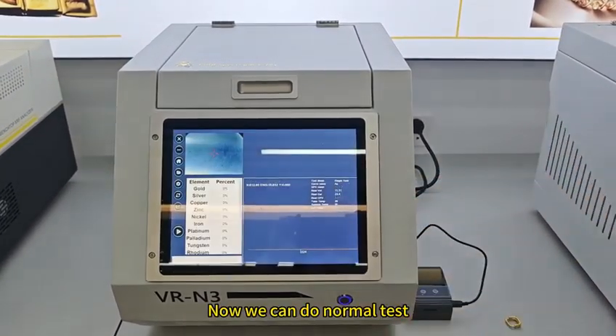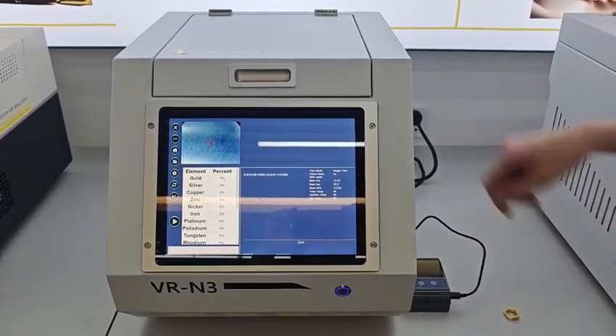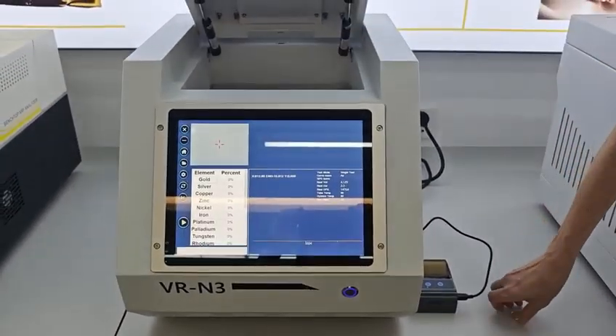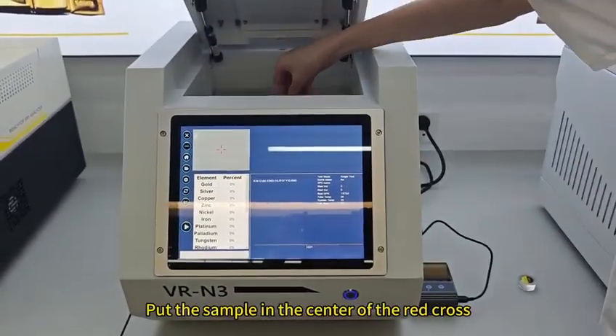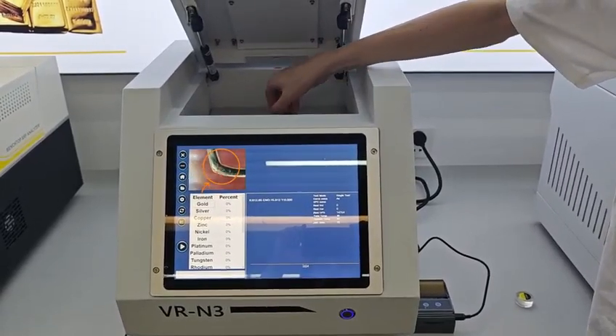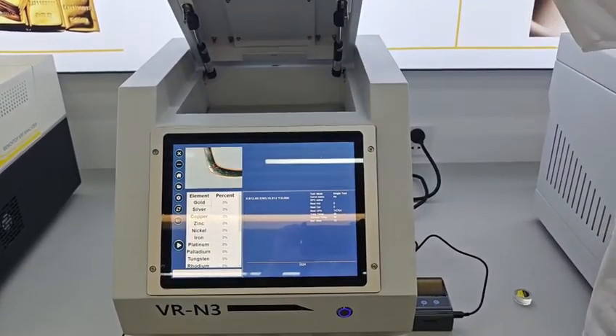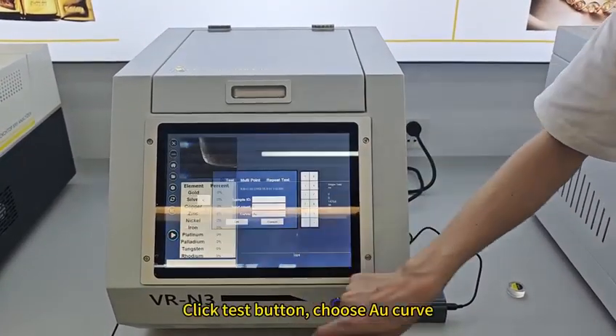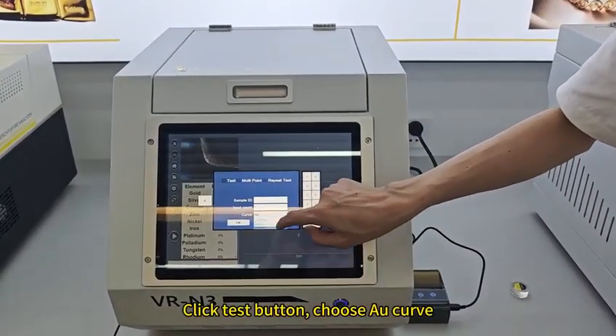Now we can do a normal test. Put the sample in the center of the red cross. Click the test button and choose an AU curve.